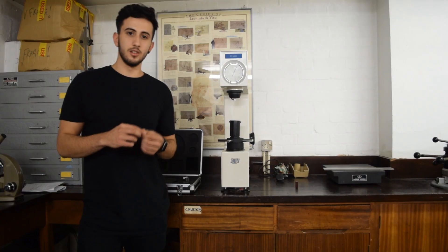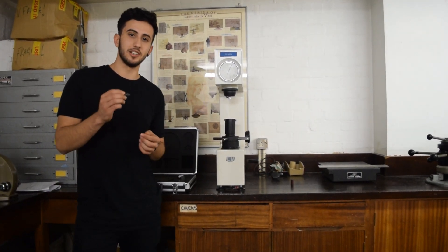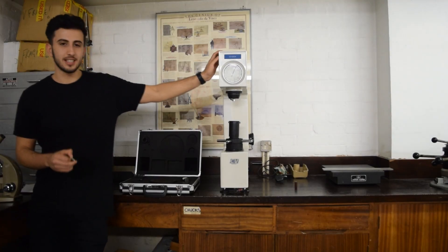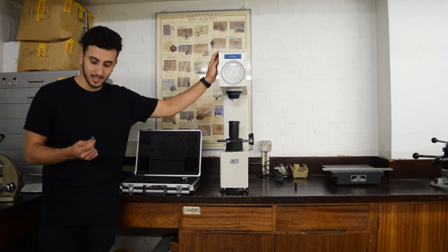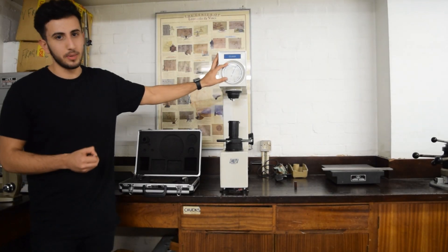The Rockwell Hardness Test is used to test the hardness of a material by indentation. This machine here is a CV600A, which is a hardness tester, and it's got two scales: Scale C and Scale B modes.